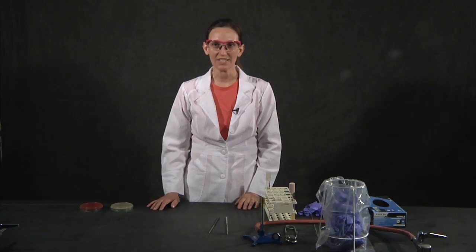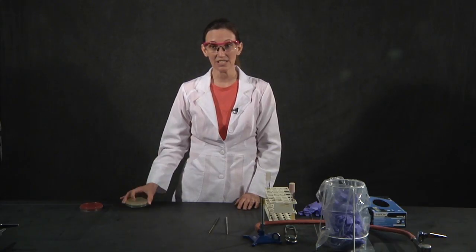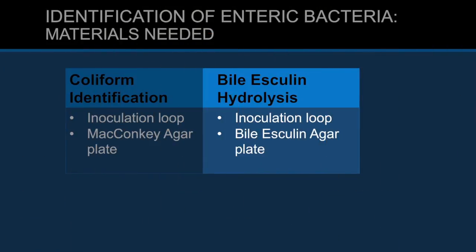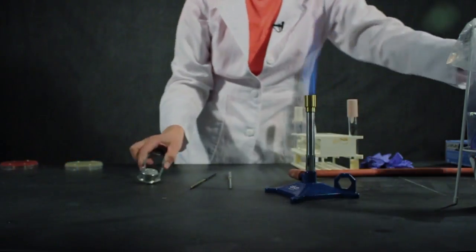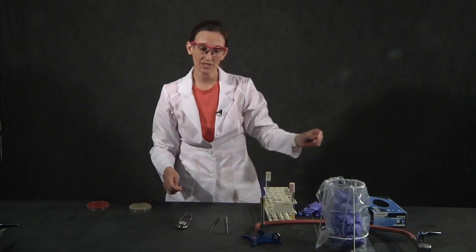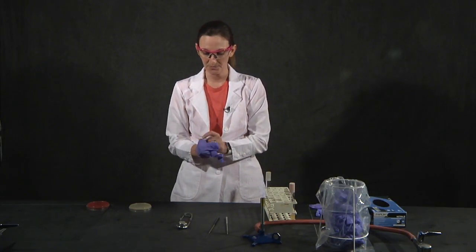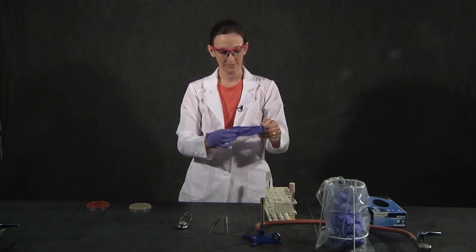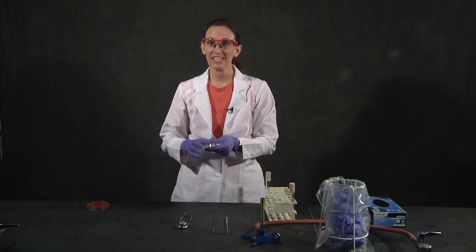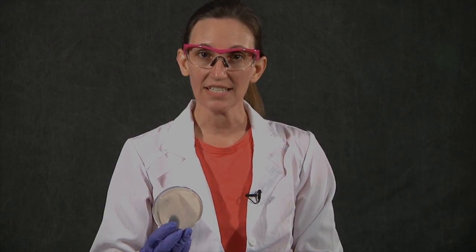The inoculation techniques for testing the enteric bacteria — the two tests are bile esculin and MacConkey agar. It's a standard inoculation; you're going to use a loop on the agar surface. We need to sterilize the loop, and go ahead and use your working stock to take the inoculum — just don't take too much. We're going to start with the bile esculin agar, and the technique for inoculating this is going to be a straight streak. We want a heavy line of growth right down the middle.